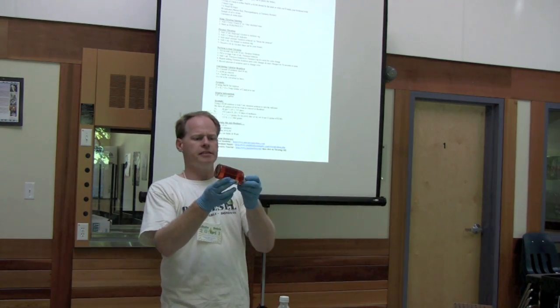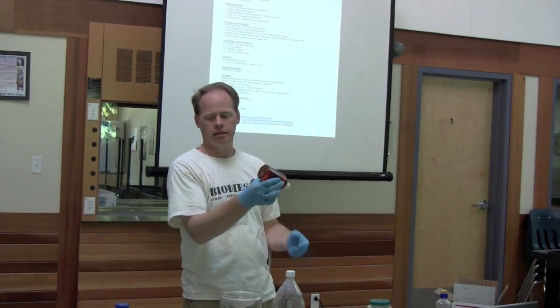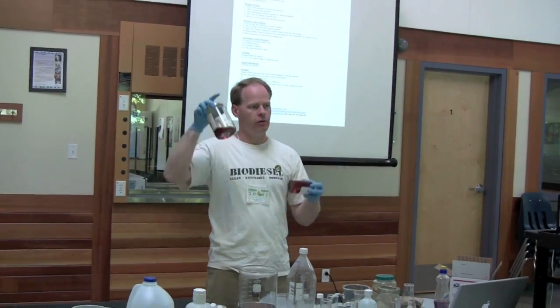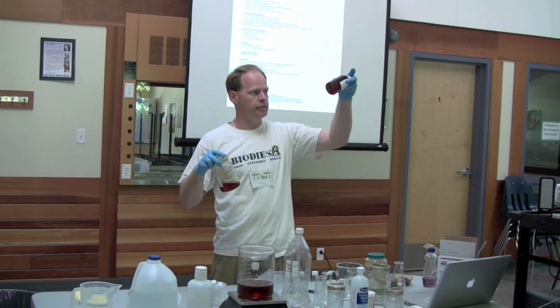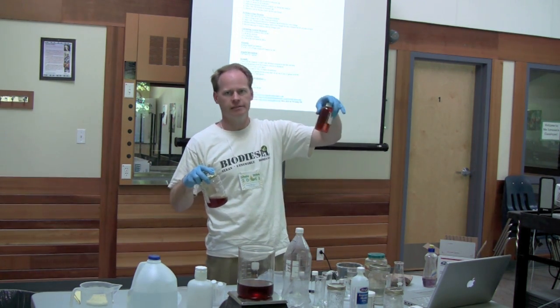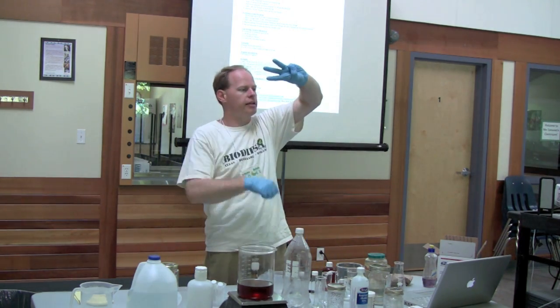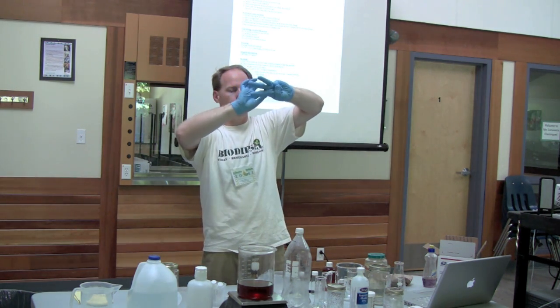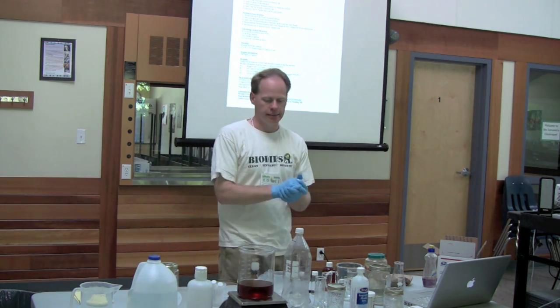It's kind of difficult to see, but this is biodiesel, and it's very, very runny. This is oil, and it's not. The reason we make biodiesel out of oil is so that we don't have to modify the diesel engine, so that we can run biodiesel in a diesel engine unmodified, because it's much less viscous. It runs, okay? Well, the glycerin molecule is part of that stuff that gums everything up, and that's why we want to get rid of it. So that's why chemically we're removing these and attaching them to methanol to make biodiesel. So we're going to make a little batch of biodiesel.